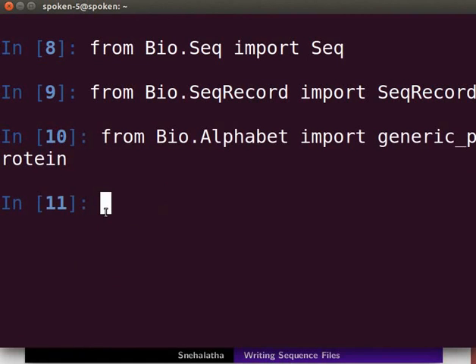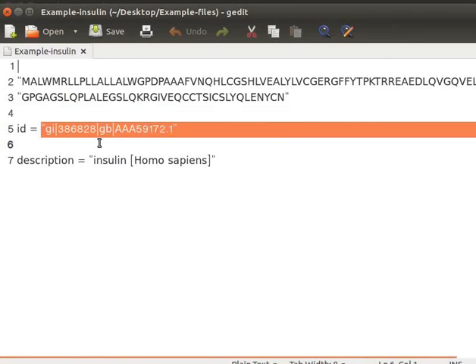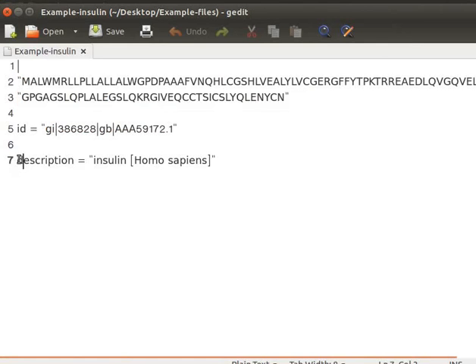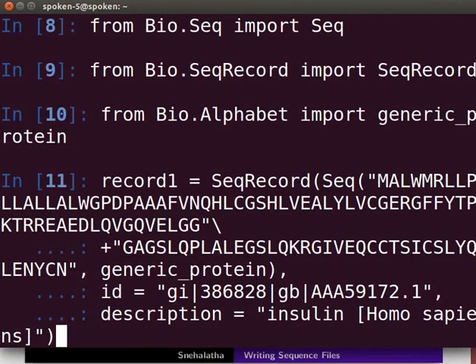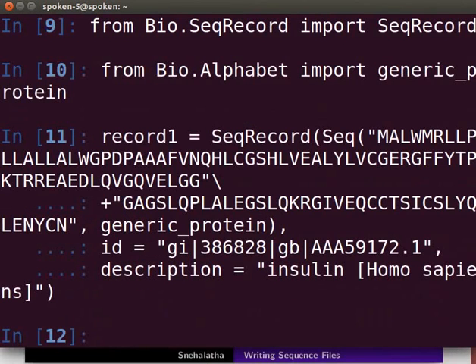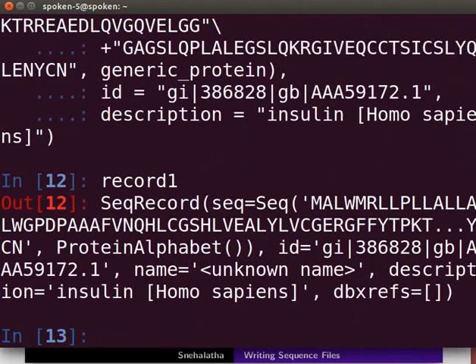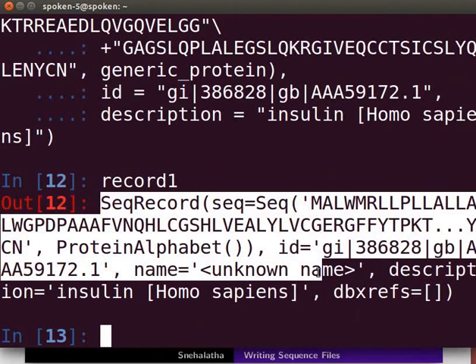Next, I will save the sequence record object in a variable record1. Copy the sequence, ID, and description from the text file and paste it in the respective lines on the terminal. Press Enter. To view the output, type record1 and press Enter. The output shows the insulin protein sequence as a sequence record object, showing the sequence along with ID and description.